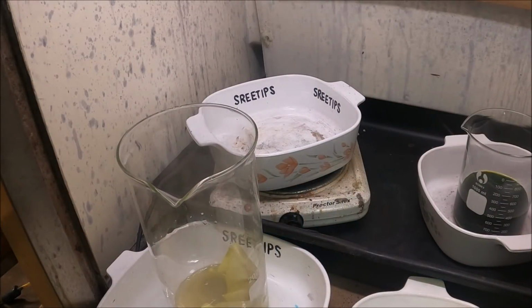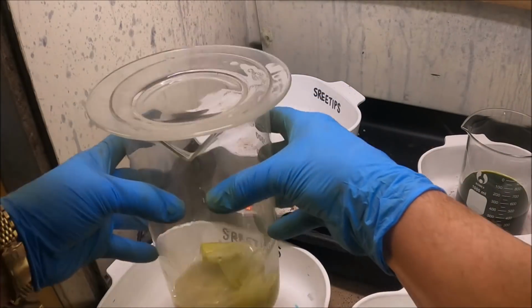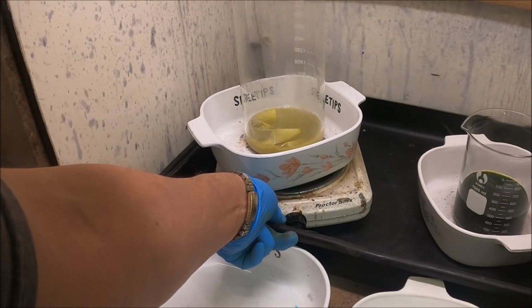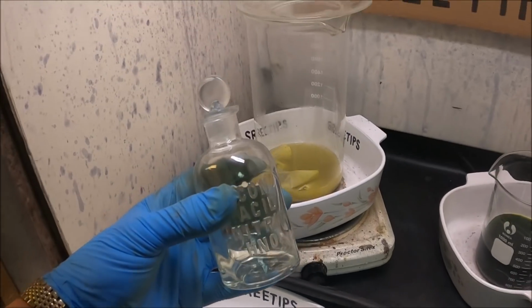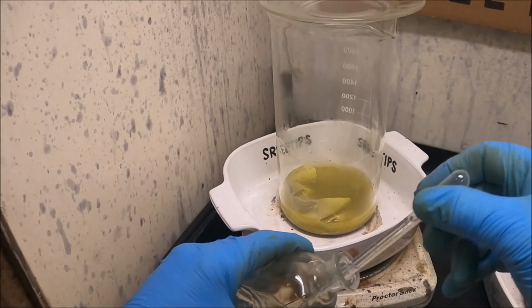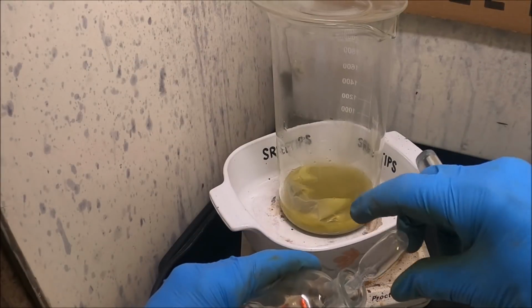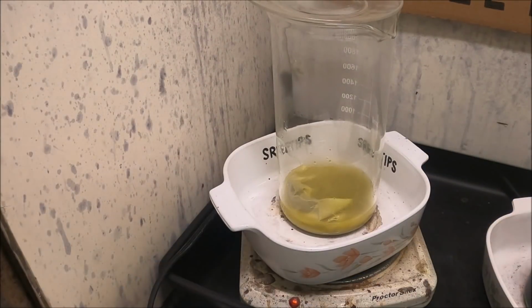And then cover it up, put it up here in the heat. We're gonna try to form some more aqua regia here and see if we can extract some more metal out of those pieces. Now I'm gonna add some concentrated nitric in here, about 6 milliliters or so. And we'll do another extraction. Let's put 10 in. 9 milliliters actually. I will let this react for a while.